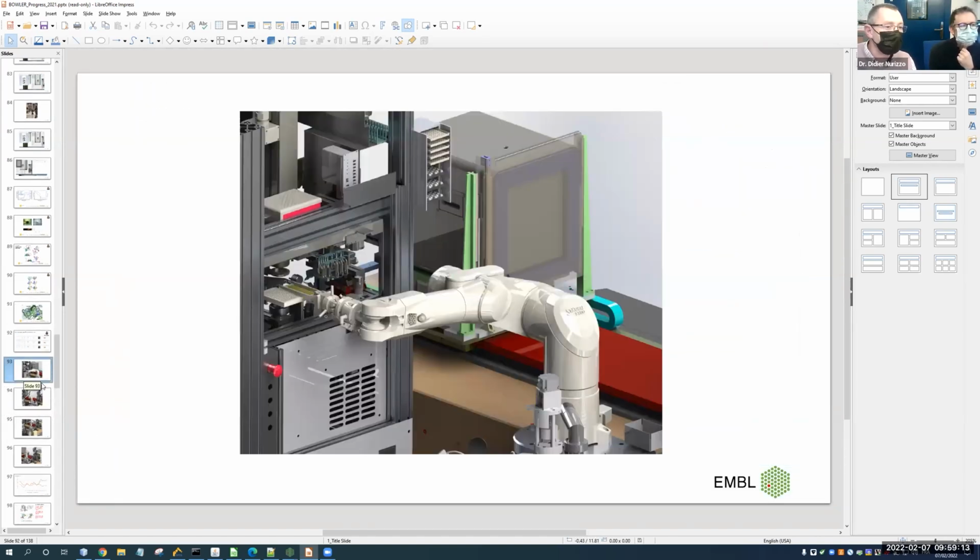Yeah, and then as Serena was saying earlier on, we're going to make this fully automated so we can load a large number of plates, move these between, and we can just keep going with either room temperature or dehydration experiments. And you can just sit back and watch the data come in.